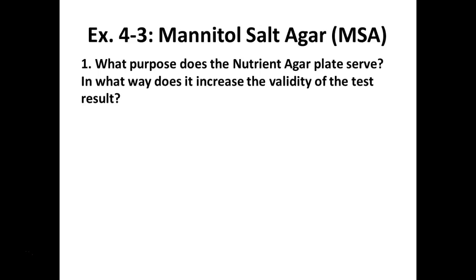There is another staph, Staph epi, that grows on your skin, which is safe. So does anybody else think they actually are seeing growth on their mannitol salt plate? The pink one, yes. Probably not. A little bit. Yeah, a little. You might have significant growth. Do you see hers? But her plate's not yellow, right? The media isn't turning yellow.